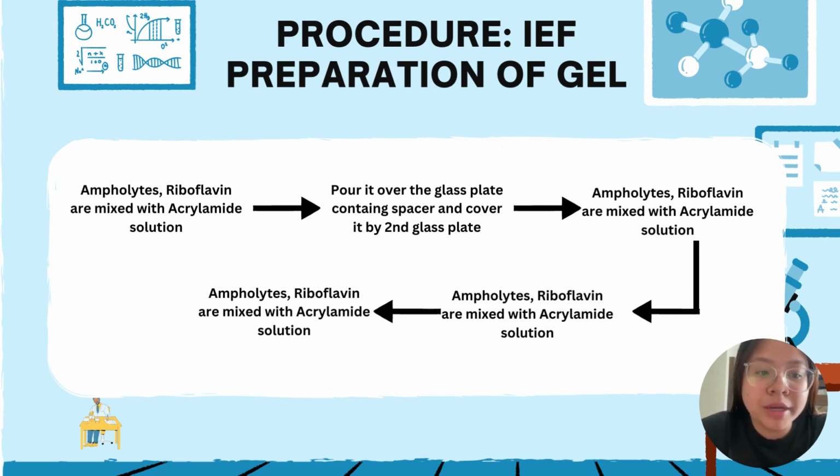Pour the monomeric acrylamide solution after preparing the glass plates. Then, distribute a thin layer of water or ethanol so it evens out the polymerization. So when the gel polymerizes, there is a horizontal straight layer. If neither water nor ethanol is added, the gel polymerizes and becomes non-adhesive.